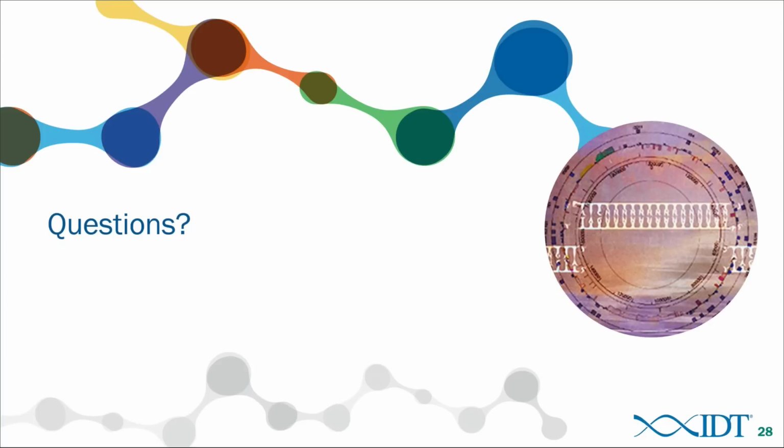All right. Specific protocol question here for you. Is the nuclease-free duplex buffer the same for the CRISPR crRNA:tracer RNA complex as it is for siRNAs? That's correct. That's the same 30 millimolar HEPES buffer and I think 100 millimolar potassium acetate pH 7.5 that we offer and use consistently with the duplexing of the Dicer substrates. Okay.